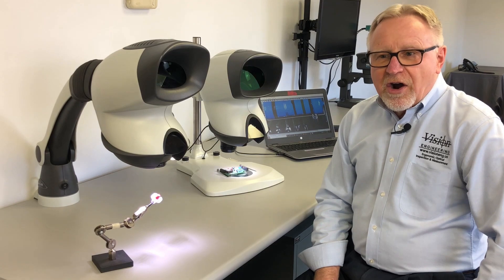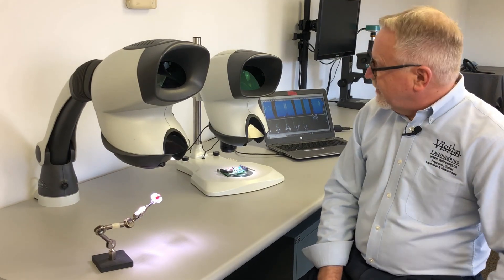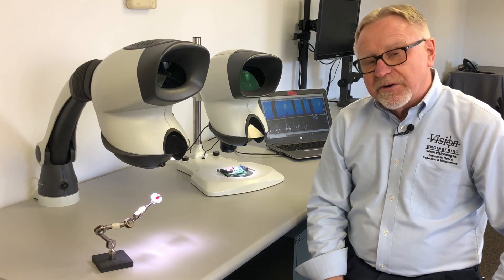Hi, I'm Gary Elm with Vision Engineering, and today we're reviewing our most popular products to date: the Vision Engineering Mantis Compact and Mantis Elite Stereo Viewers.